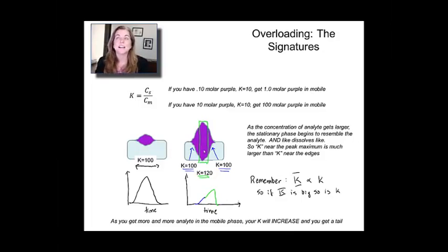But now, let's look if you overload your column. Well, what happens at the peak height is that you've got so much analyte in the column that it starts to look a lot like the analyte. It's kind of like having a sponge that's over-saturated with water. Well, it's going to absorb more water. And when it does that, its partition is actually going to increase.